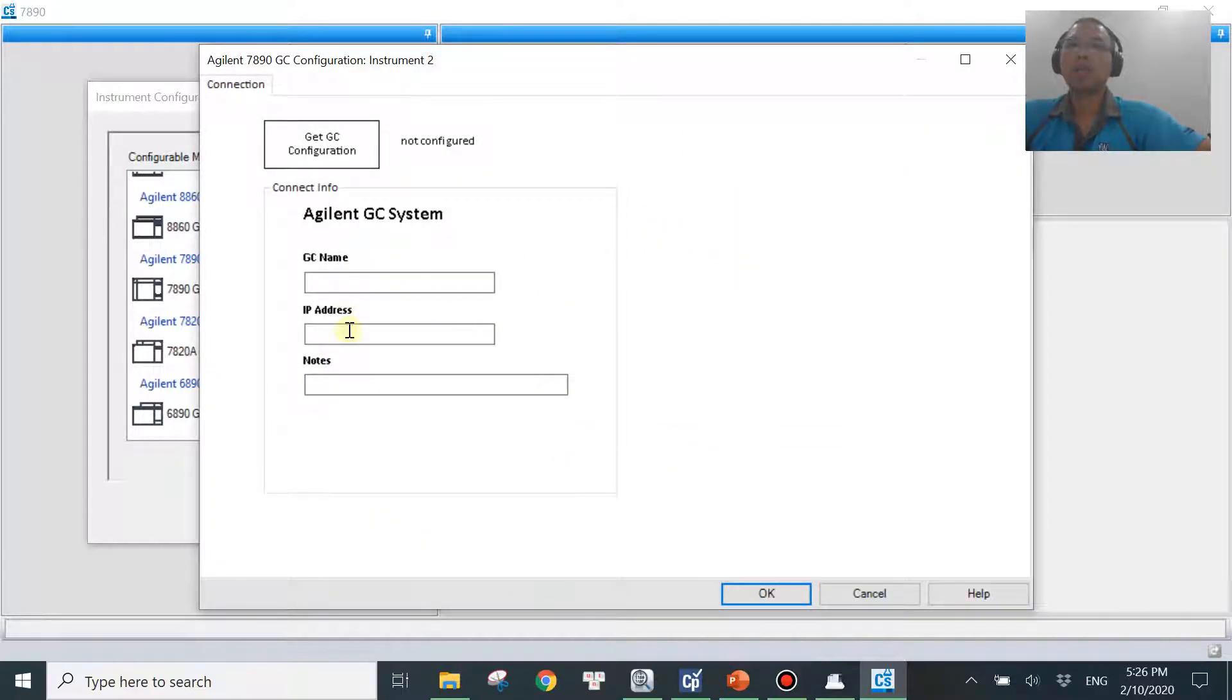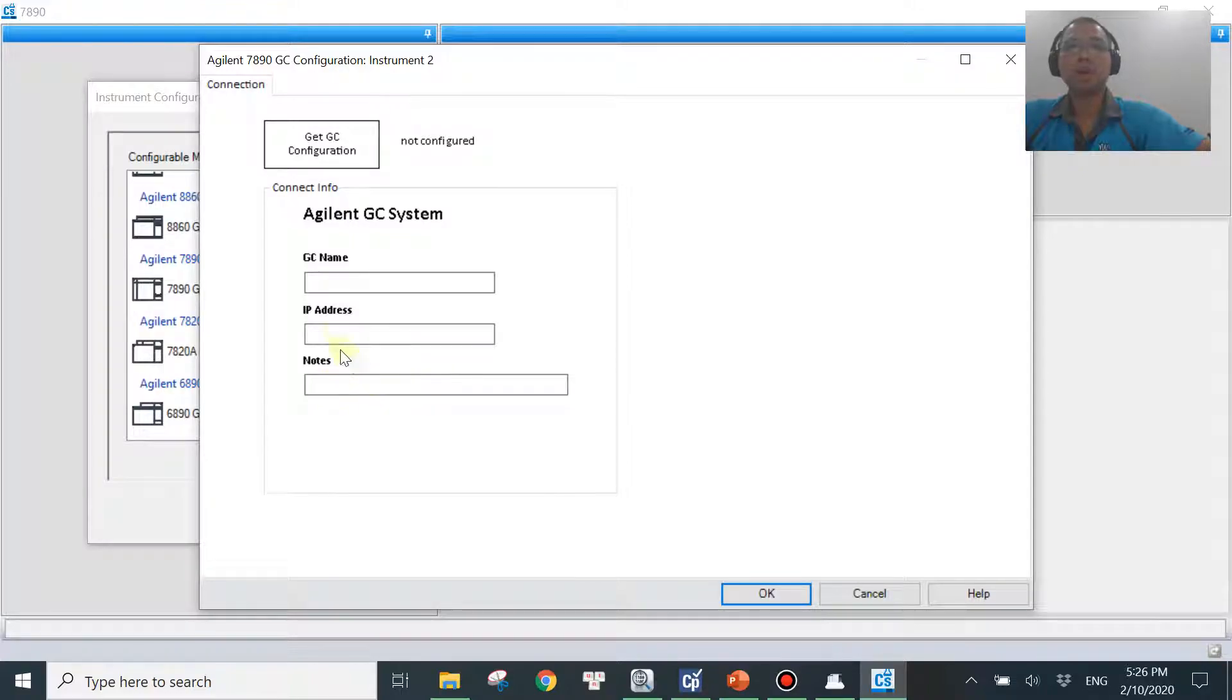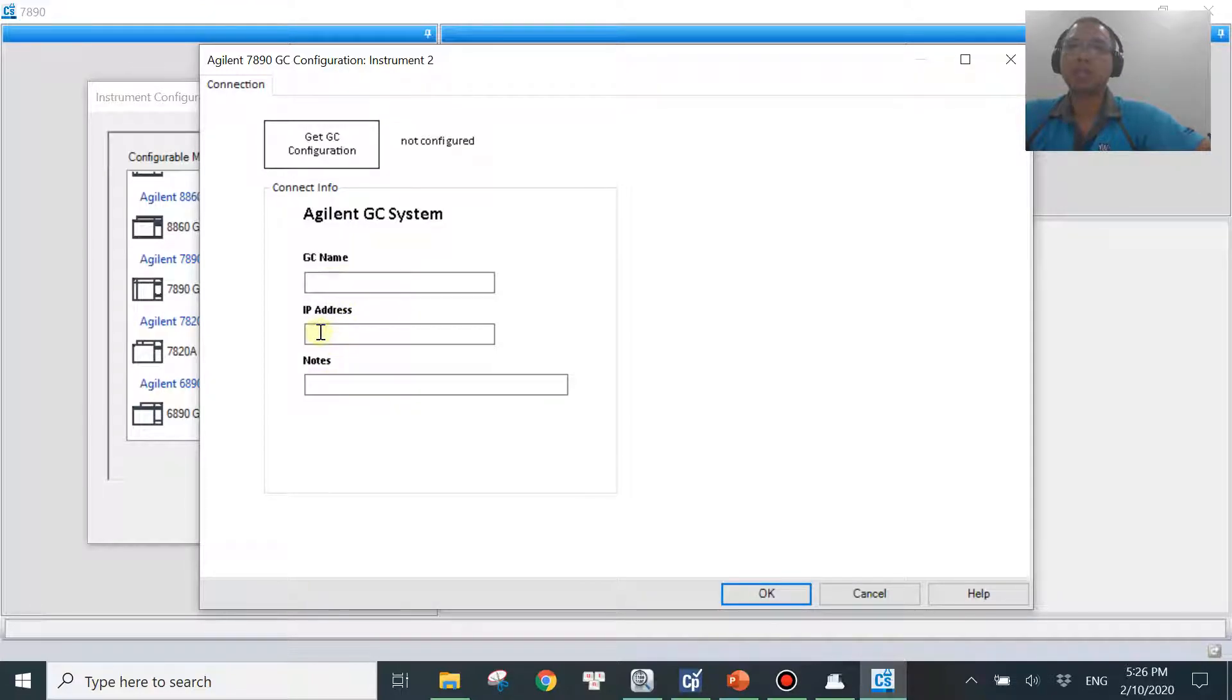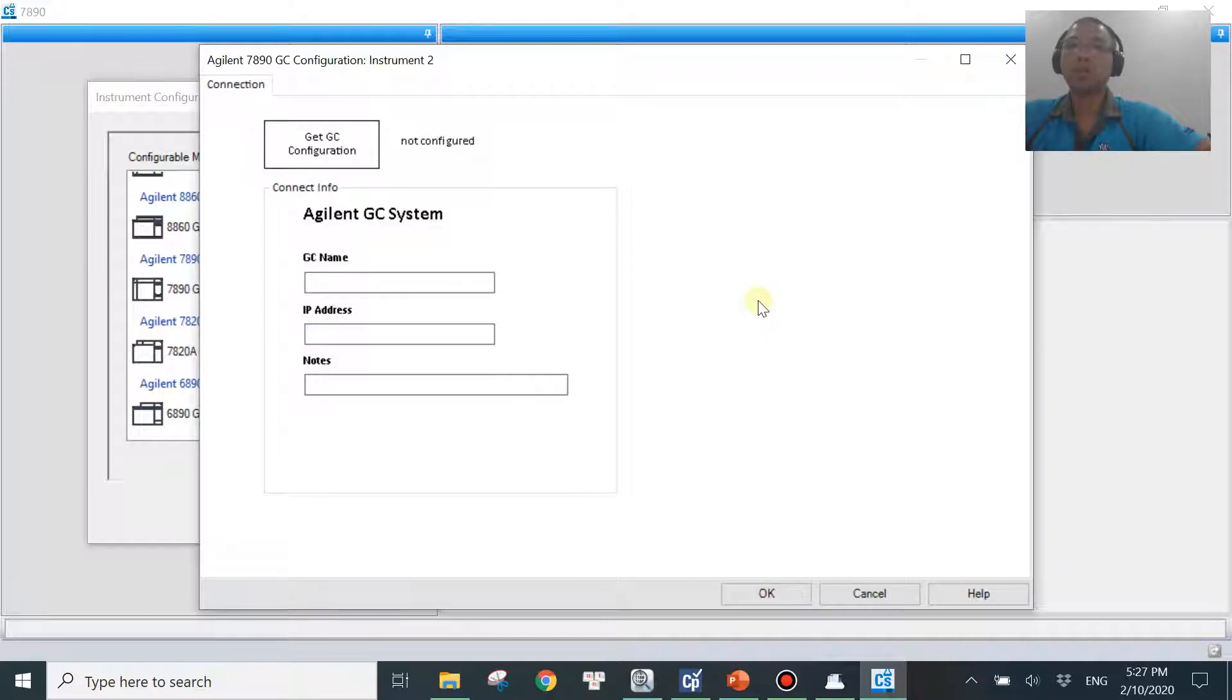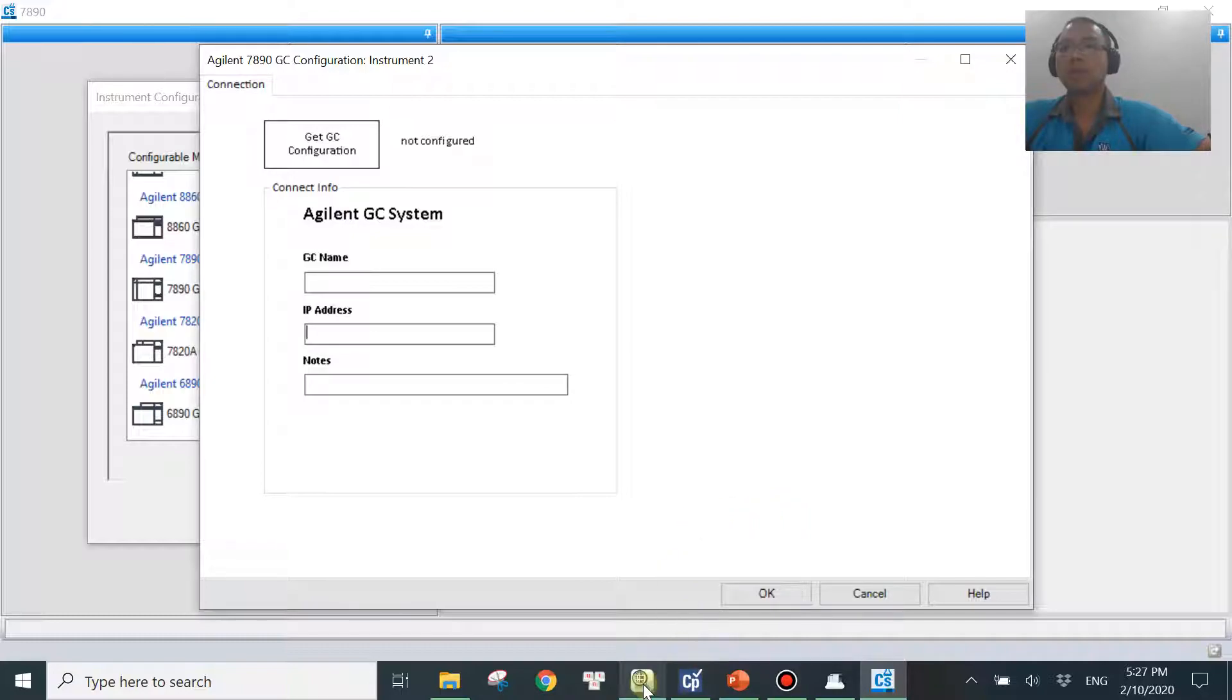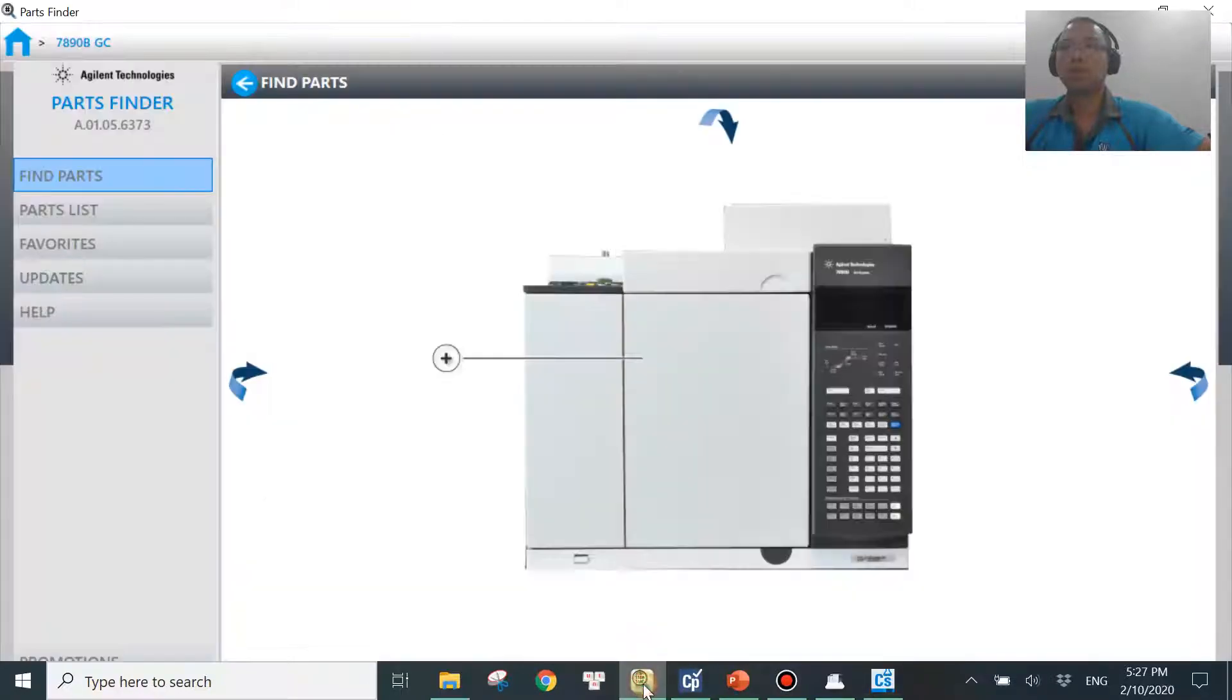And it will ask you for the IP address, GC name and the notes. You don't have to key in anything. It's just optional. But IP address is something you really need to key in. And in order to know the IP address of your instrument, in this case, GC, you want to go into this.